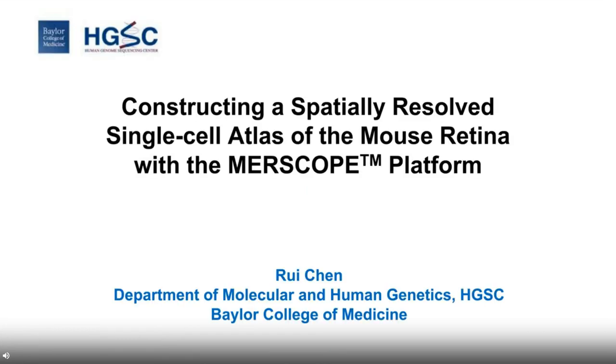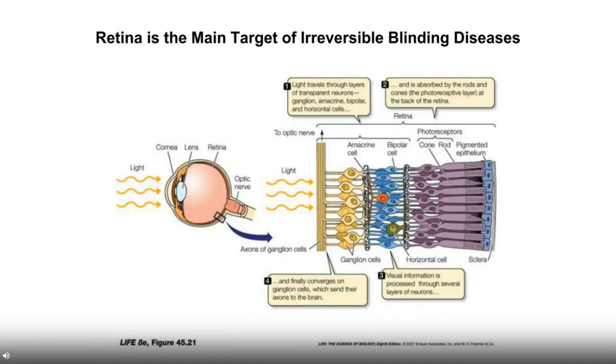So first, I'd like to thank you for the introduction, and I'm also really happy to have the opportunity to share with you our experience with the MERSCOPE platform, using this wonderful technology to build a single-cell atlas of the mouse retina.